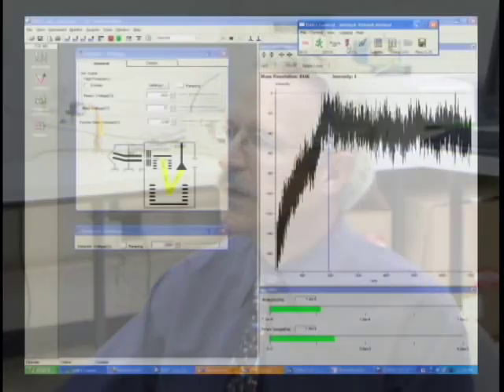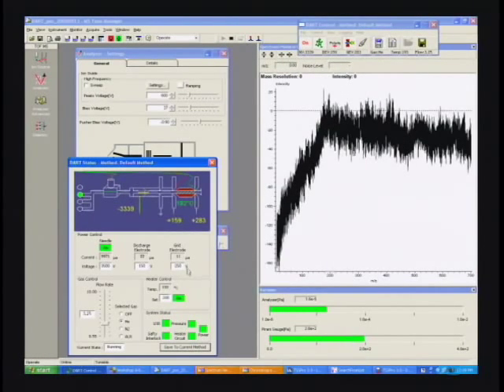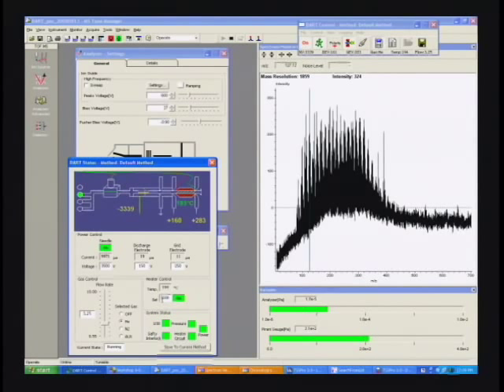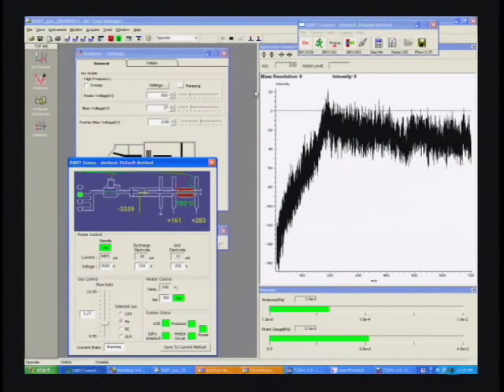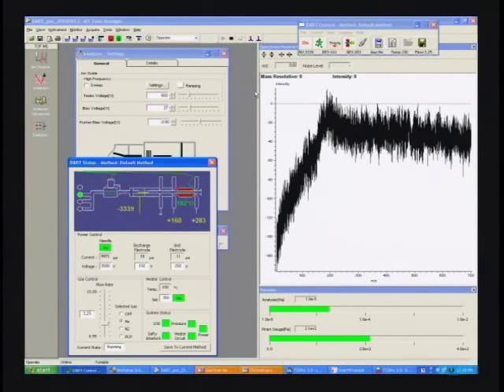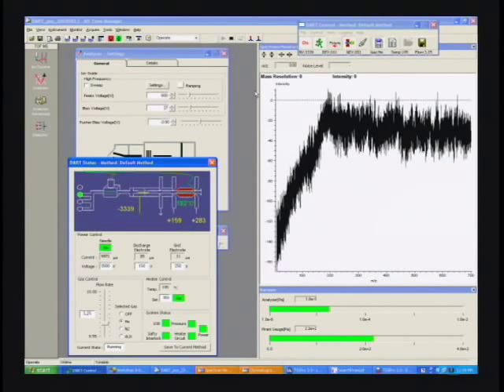With polymers, we can do two things. We can look at them at a lower temperature and find out what the additives are, and then we can raise the temperature and do a kind of pyrolysis to decompose the polymer into fingerprint fragments. For example, nylons will show series polycaprolactam. You'll see peaks caprolactam times n plus one. Styrene will show some characteristic peaks at, I think, 105 and some other masses. Right now, we're not trying to get the entire polymer. We just want to see characteristic peaks that let us identify which polymer it is by its fingerprint pattern by comparing spectra with the database. So we'll turn the dart temperature up. Turn it back on again. We'll go back to positive ion mode and let it switch those two potentials. Let's run this at about 350 degrees C. So that's a little bit hotter than what we've been doing before. This is actually a destructive technique. It's going to melt a piece of the plastic. So you want to use as small a piece of plastic as you can afford to use.